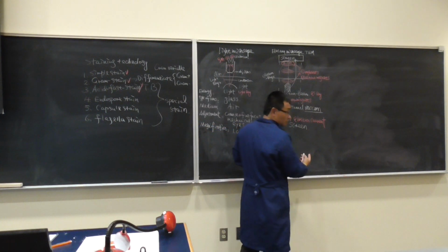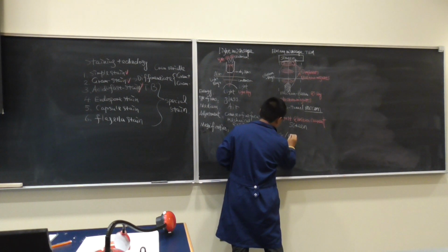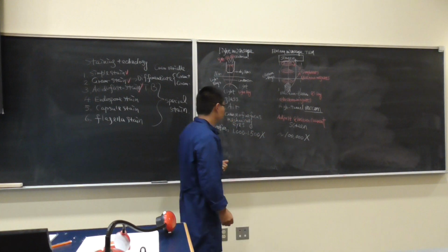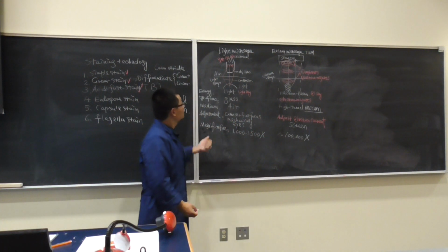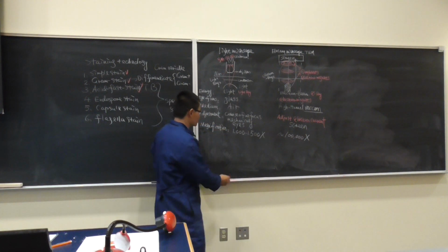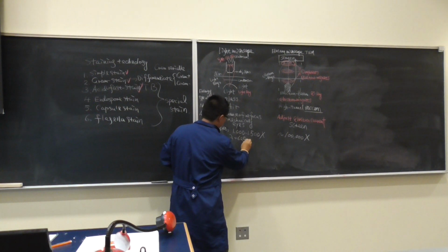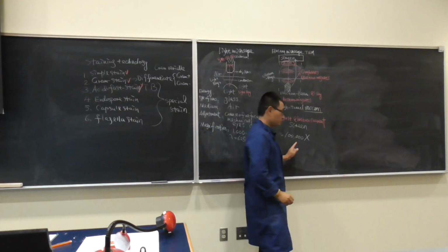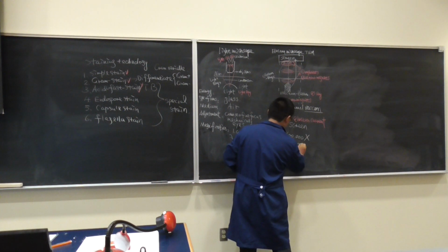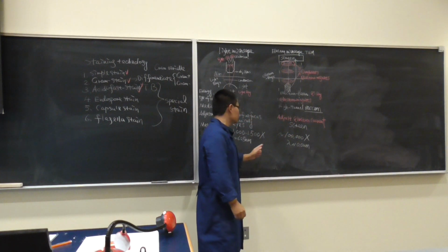If it's a transmission electron microscope, it could be around 100,000 x. Now why? This is a light microscope. Light is the energy source. The lambda is around 625 nanometer. This guy is the electron beam. This lambda is about 0.2 nanometer. And the smaller the better.